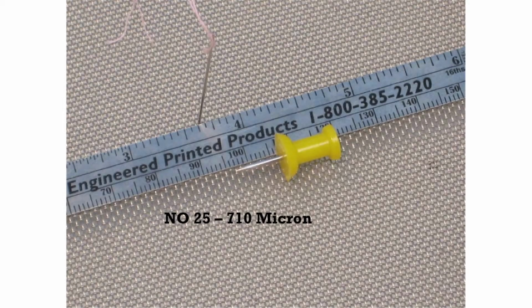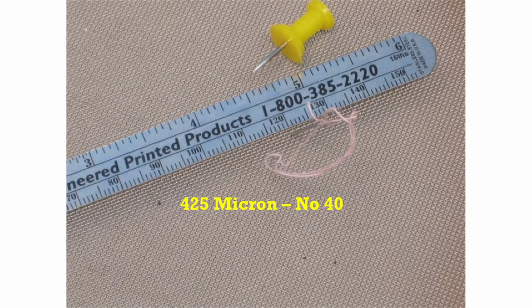As the sizes get smaller, for example, a 710 micron, number 25 sieve, a small sewing needle will pass through an opening, but a push tack will not. At the level of a 425 micron sieve, or a number 40, only the point of the needle will fit into the holes in the mesh.